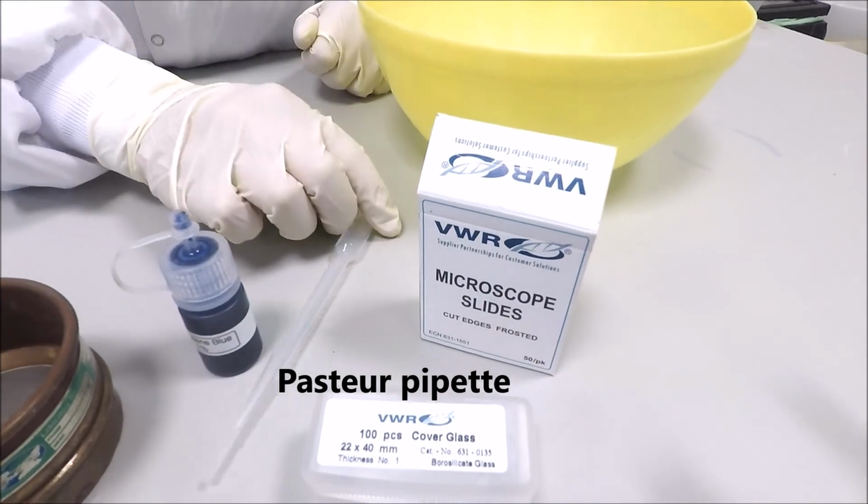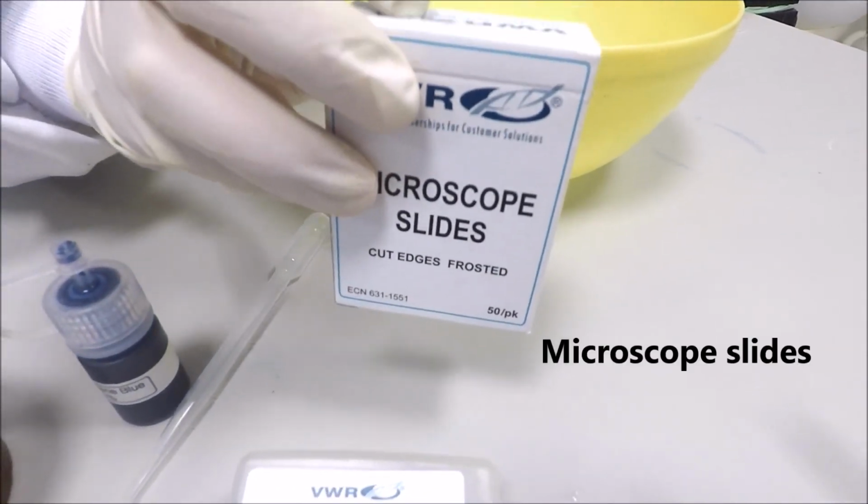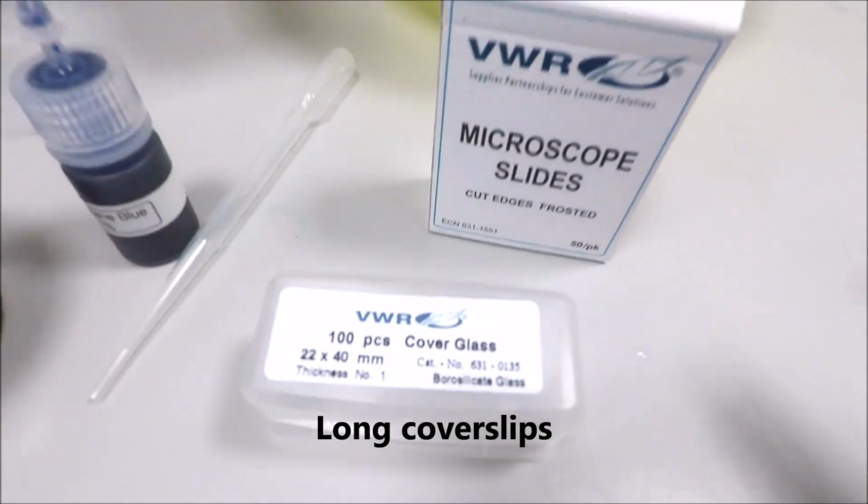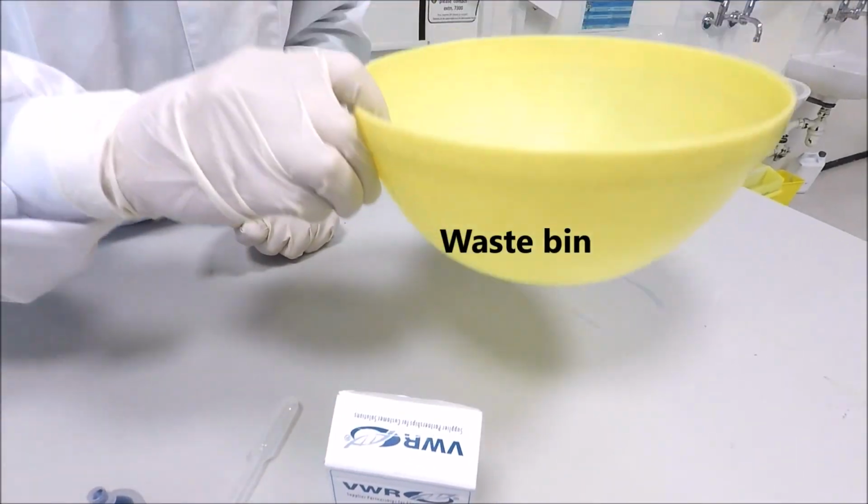Pasteur pipette, microscope slides, long cover slips, and a waste bin.